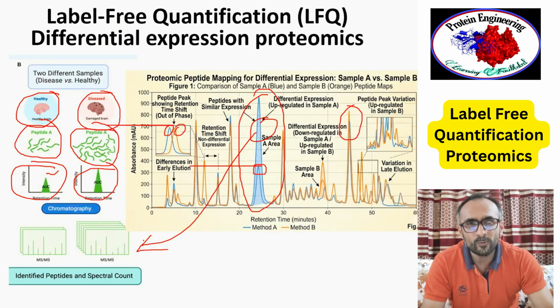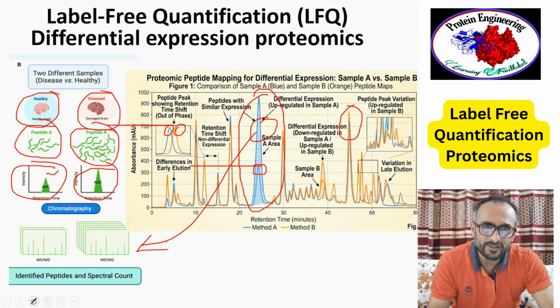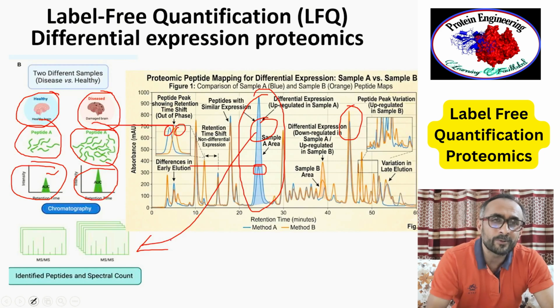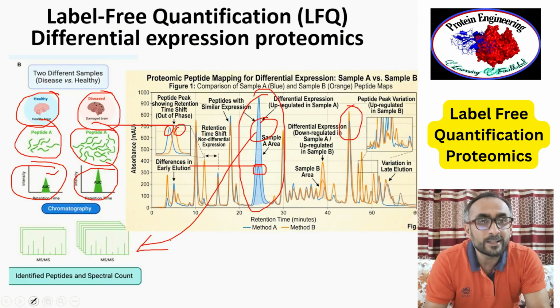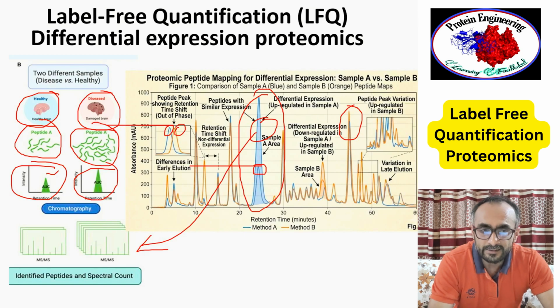After getting the sequence, you can do a database search and identify the protein it is coming from. So you conclude that this protein is present in high concentration in sample A, and in lower concentration in sample B. In fact, you can precisely quantify its concentration in the A sample and the B sample. And that was one of the major objectives of proteomic studies.